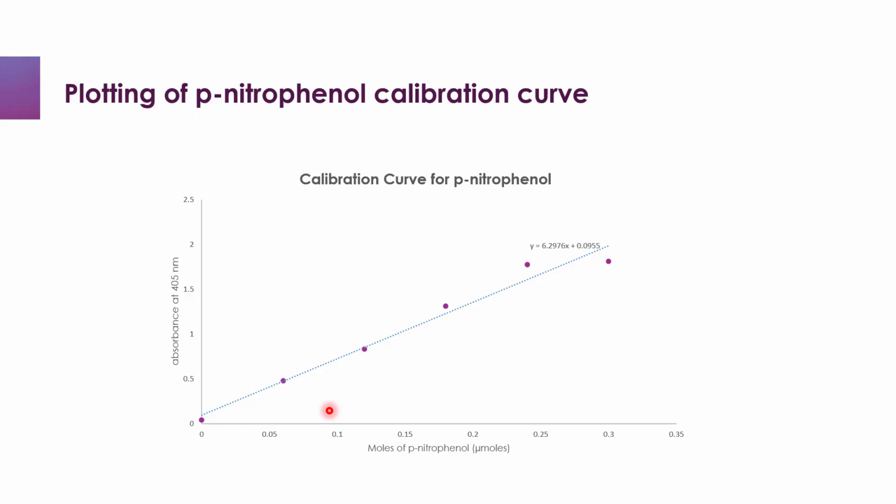So this is the nature of graph that we are going to get, and I will also encourage that for detailed information on how to plot a calibration curve, just watch my video on calibration curve.